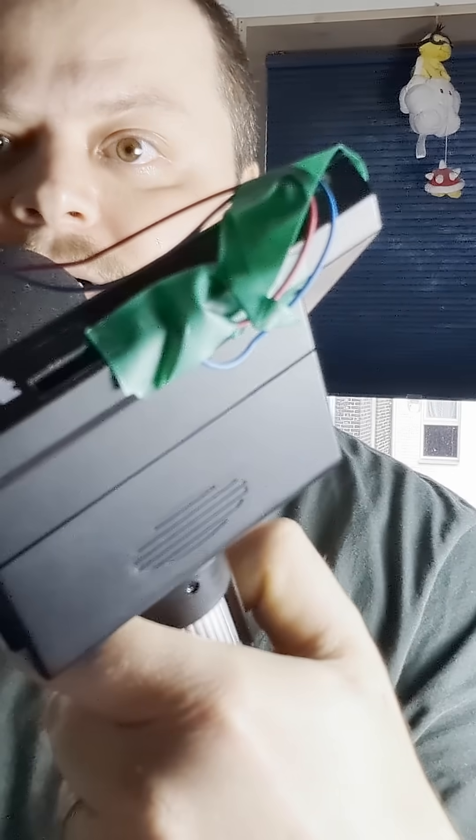Some time ago this microscope took a nasty fall thanks to my dog. So what we're gonna do in this video is we're gonna open this microscope up and try to repair it. Let's get it open.